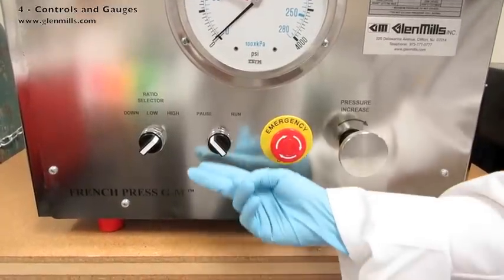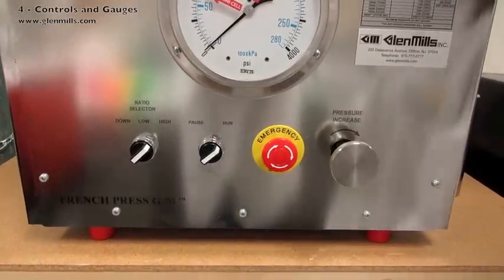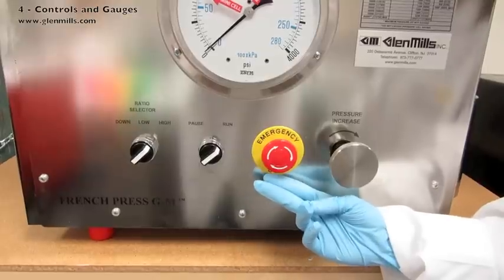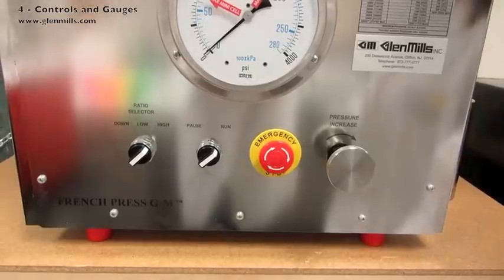The pause/run switch can be switched to run to turn the machine on. The e-stop button is for emergency stops — by pushing it in, all electricity is cut and the unit will stop moving.